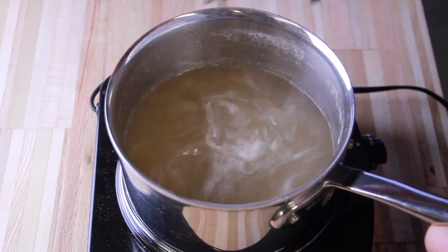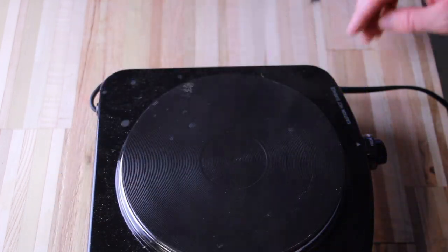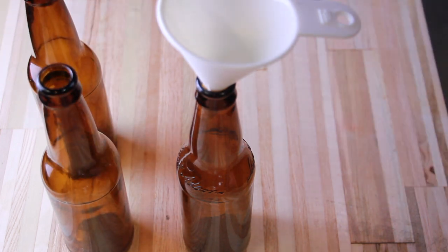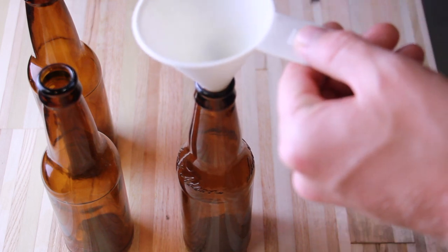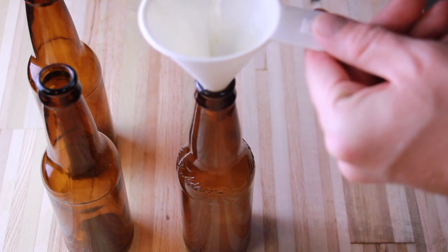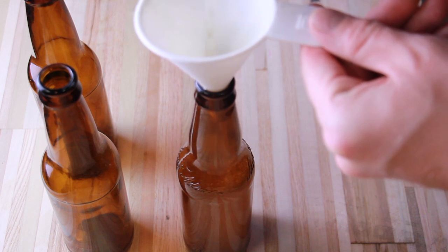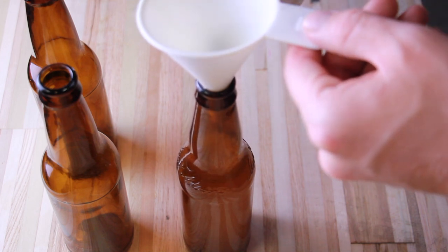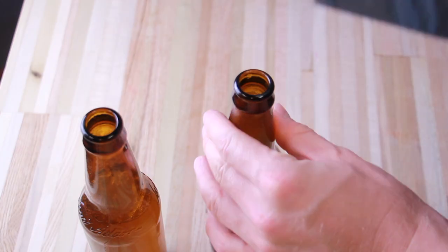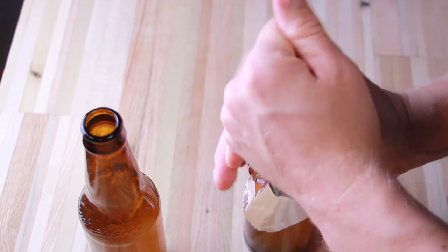After I got all the clumps out, I was ready to pour it into the bottles. I'm using 12 ounce bottles, and I had 3 bottles just in case. I'm pretty sure I boiled off like half of the water trying to get the clumps out, so I only ended up filling 2 bottles. I put some aluminum foil over the top to prevent steam and water from entering the bottles while pressure cooking.